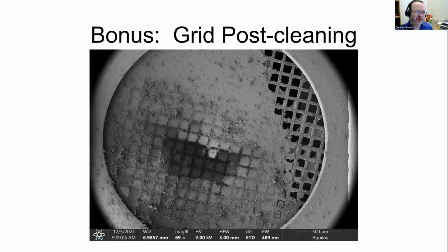If you can manage it, don't leave your lamella sitting in cryo storage. Stick it directly on a Krios or your other system of interest. This goes for materials too, if it needs to be cryo, because maybe you're working with lithium and it's oxygen sensitive or whatever it happens to be. So that's my recommendation for that.